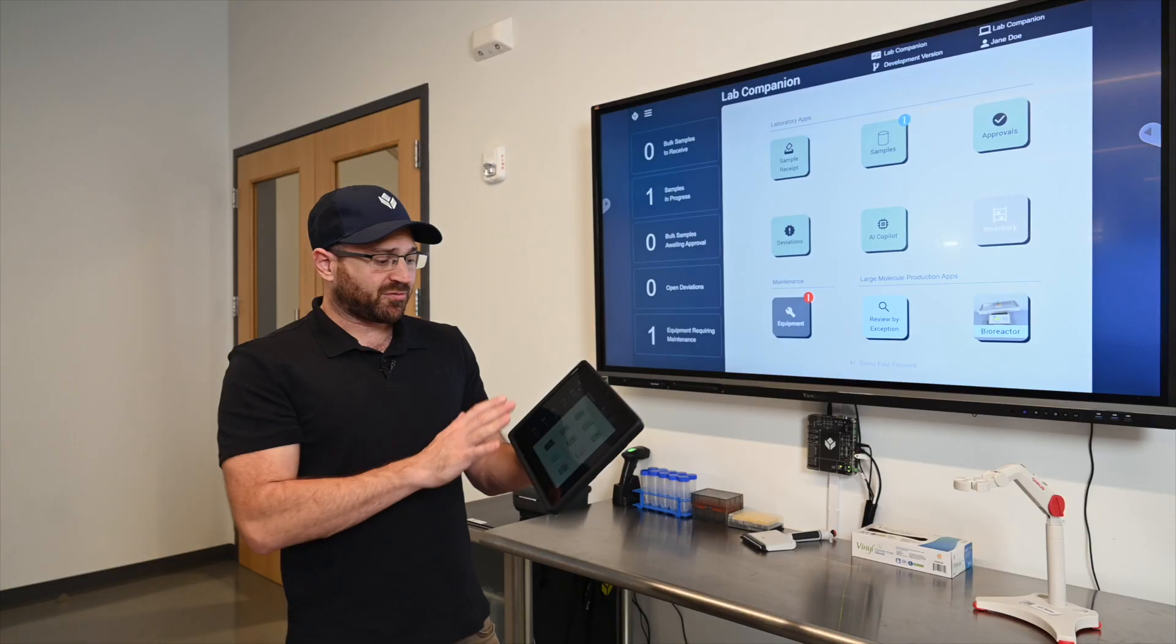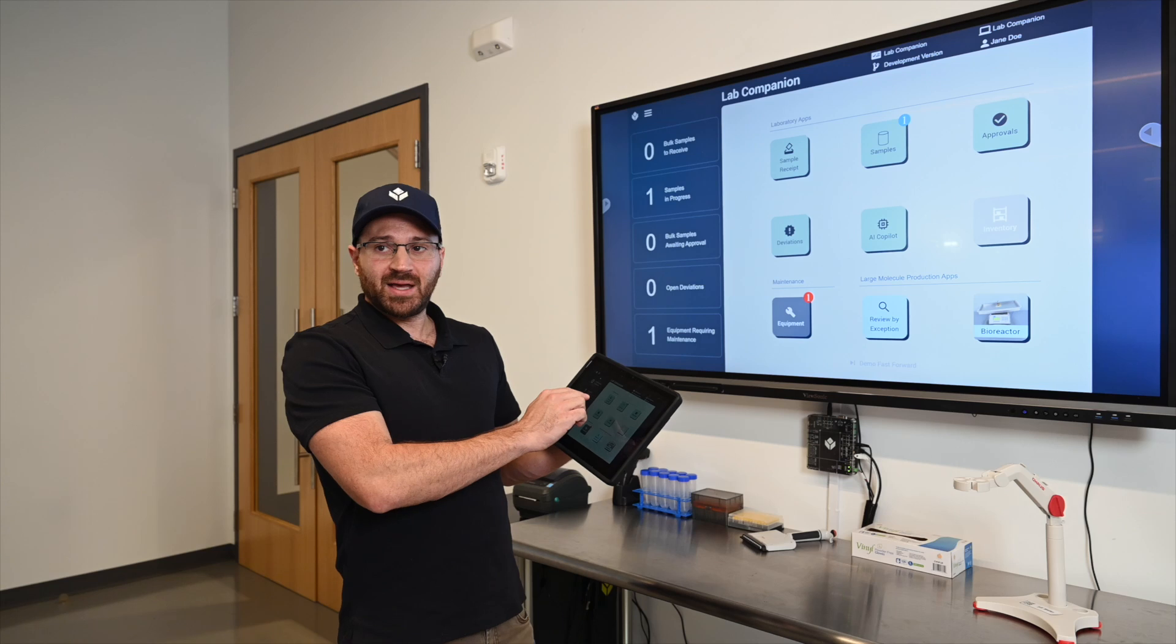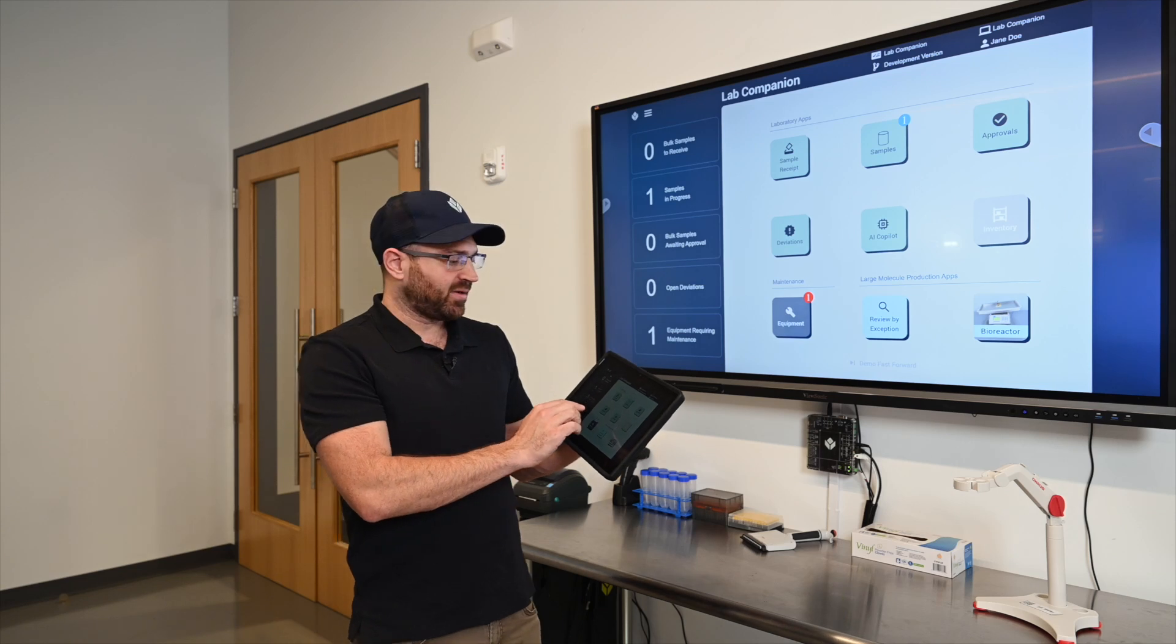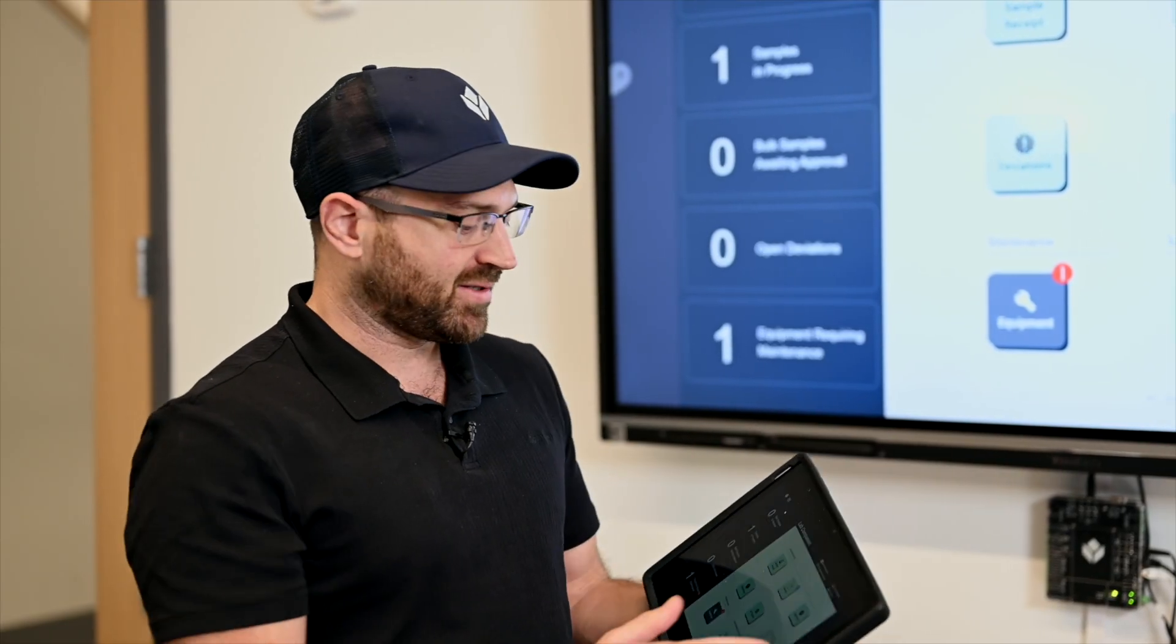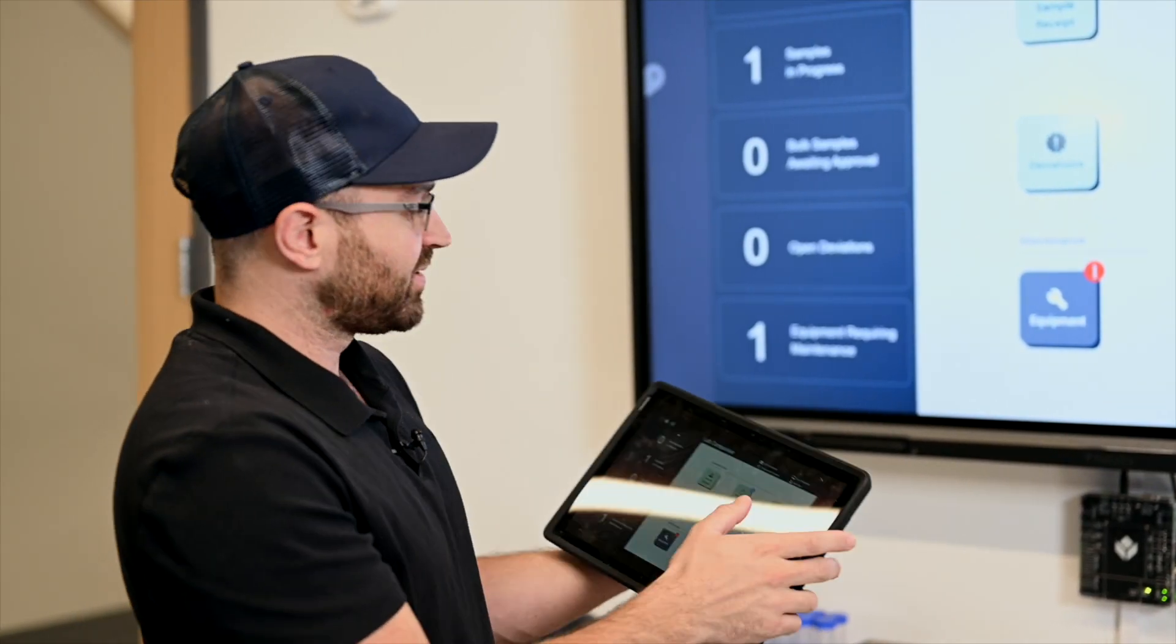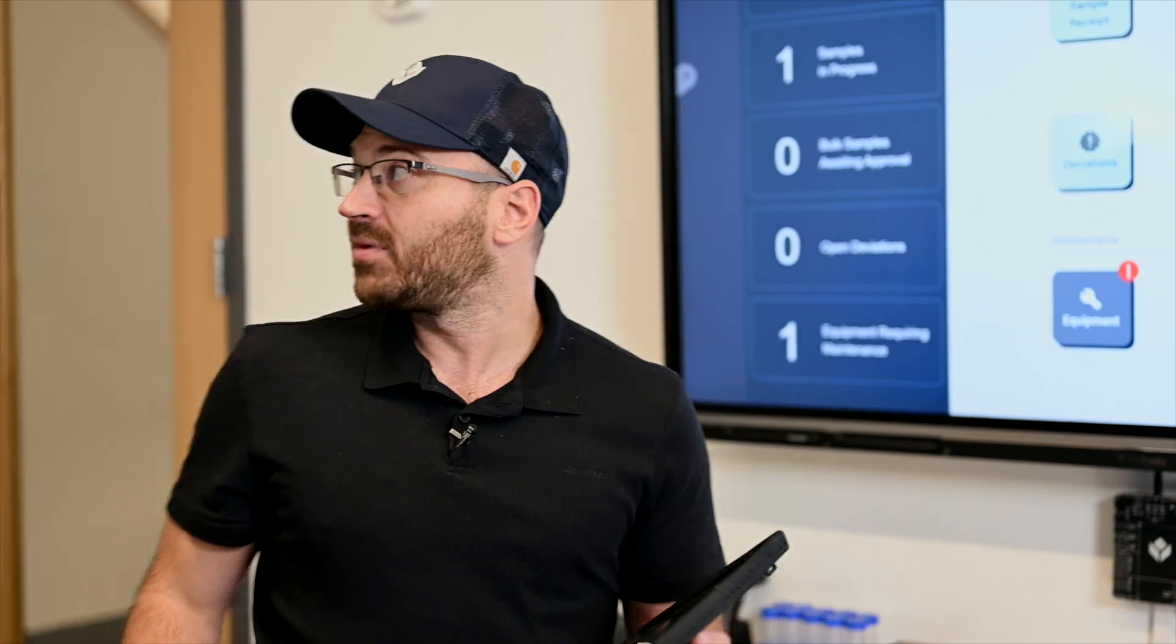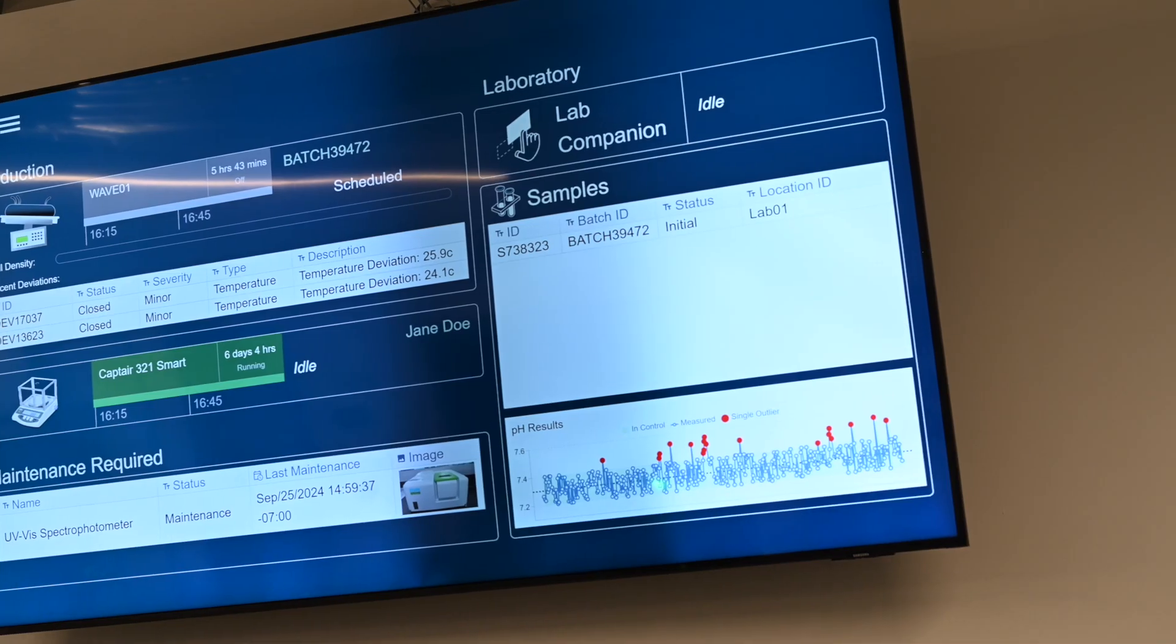We just jumped from the lab companion app into the sample receipt app, and now as a lab analyst I can see that I have a sample in progress. It's also represented on the dashboard that I have a sample that's been received.